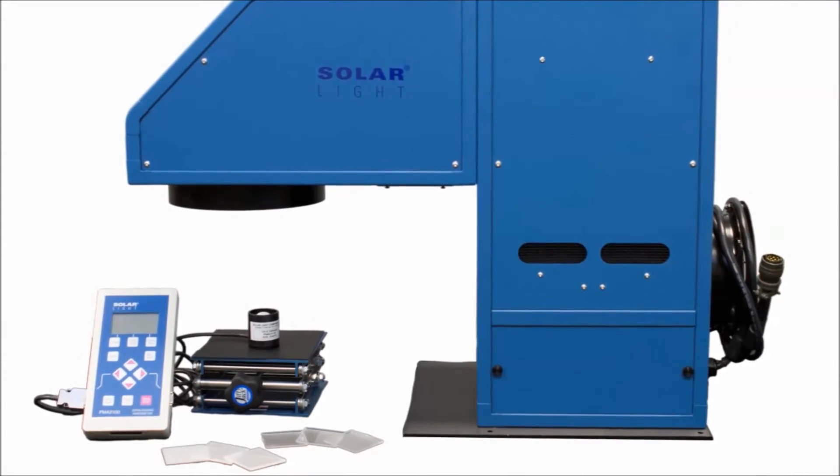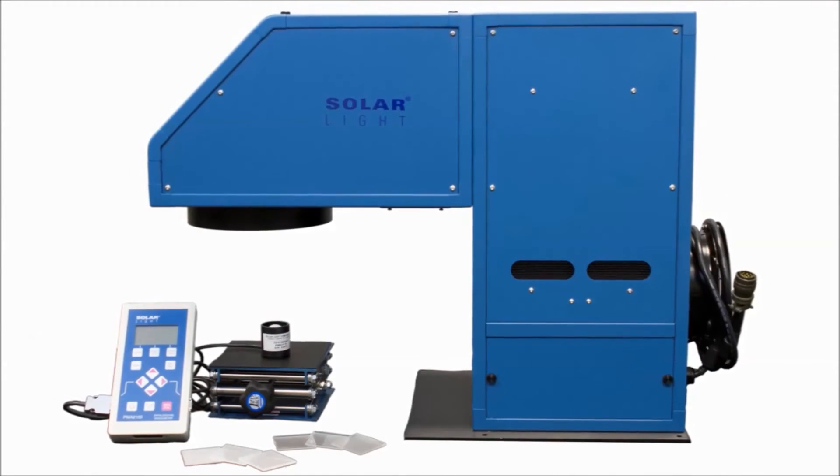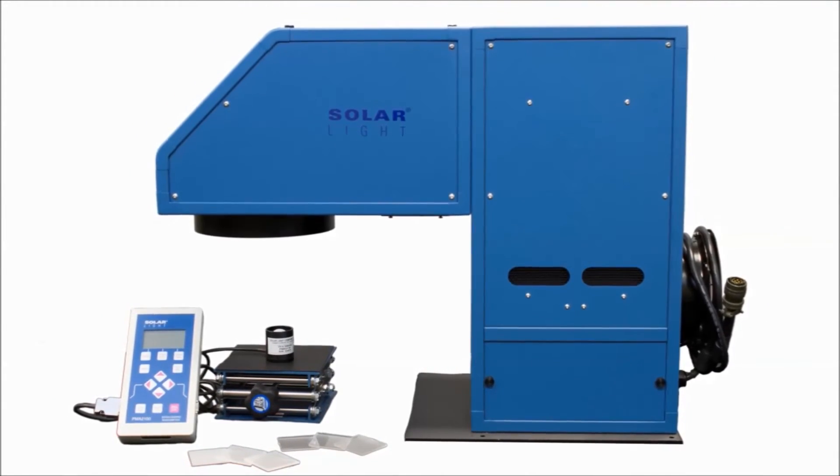Many of the ASTM's testing standards can be accomplished with the LS1000 simulator, including G173 and E927.